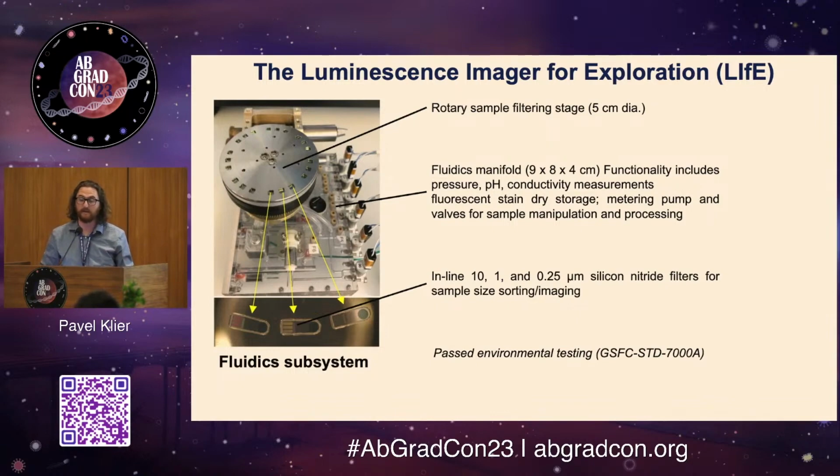One thing about microscopes and fluidics is that they have a fair bit of spaceflight heritage, but in general, hardware can break. I'm sure everyone who's worked in a lab has dealt with a lot of issues before. So you want to make sure that these things are robust and you can actually get them to where you want to launch them to.